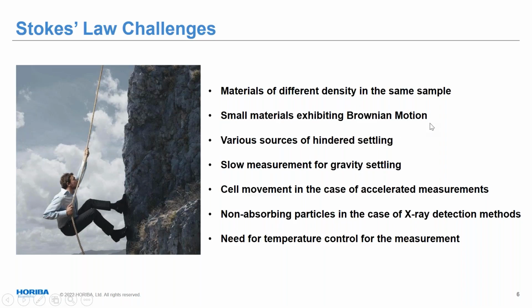As you start getting down, really below about maybe 5 or 10 microns, particles are going to begin to move in different directions as a function of time and not just settle like you want it to do for Stokes' law. And so you're going to have to figure out at what point you can now no longer trust your sedimentation data to be pure sedimentation, because you can't have two different types of equations operating, or two different forces operating on your particles at the same time and have Stokes' law work properly. So, again, certain techniques go all the way down very small in size and use Brownian motion for the entire measurement, but where we're trying to operate, we've got to stay away from Brownian motion.